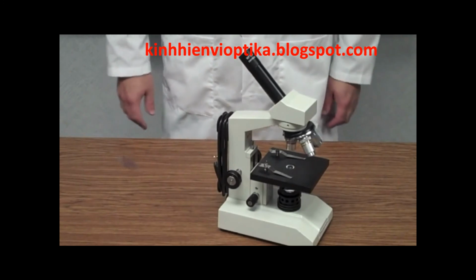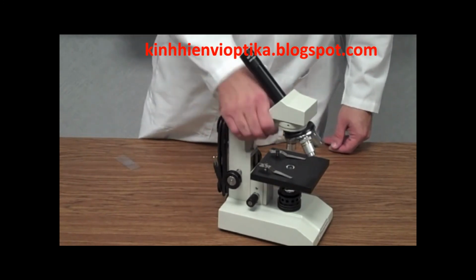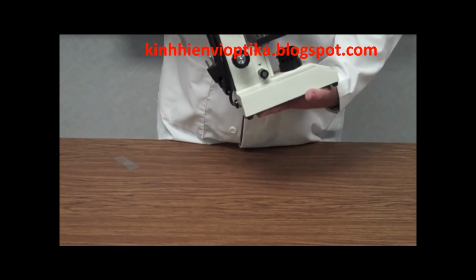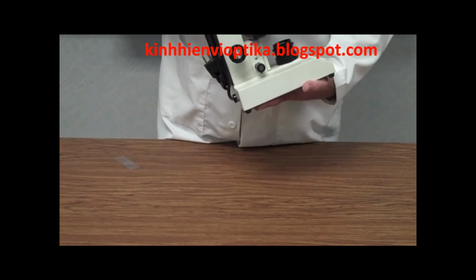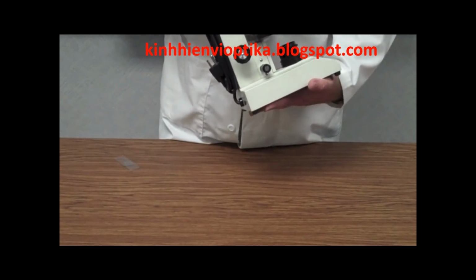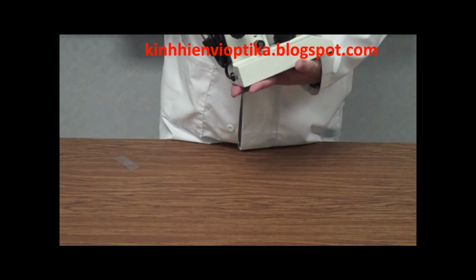the microscopes for me. Anytime I'm carrying a microscope from one location to another, I put one hand on the arm and one hand underneath the base. These microscopes are fairly expensive. They're over $100 a piece, if not more, so we want to be careful and not drop them and break them. And we want to take care of what we have. So one hand on the arm, one hand underneath the base.